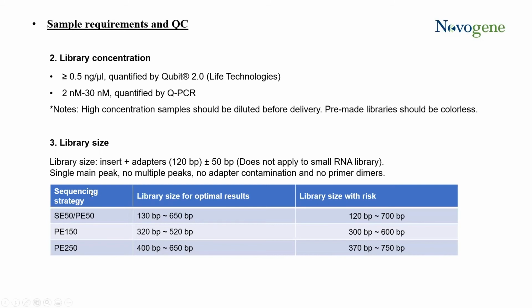So this is the ideal size for the given sequencing approach, but something we also want to pay attention to is inserts that are too large. Too large of inserts can really cause issues with cluster generation. Imagine you're sticking your arm on a table with your elbow facing up at a 90-degree angle. That itself is the library.